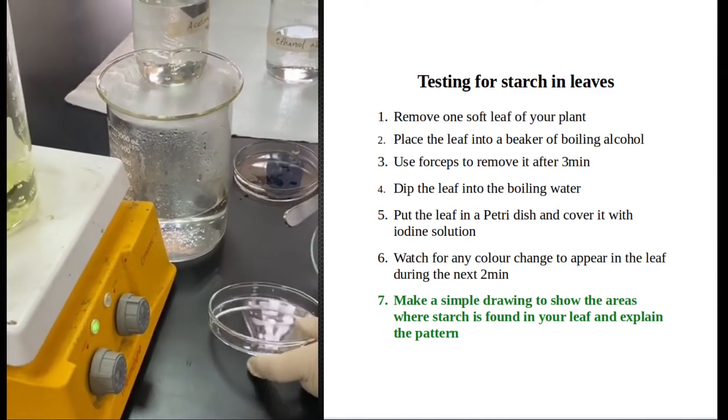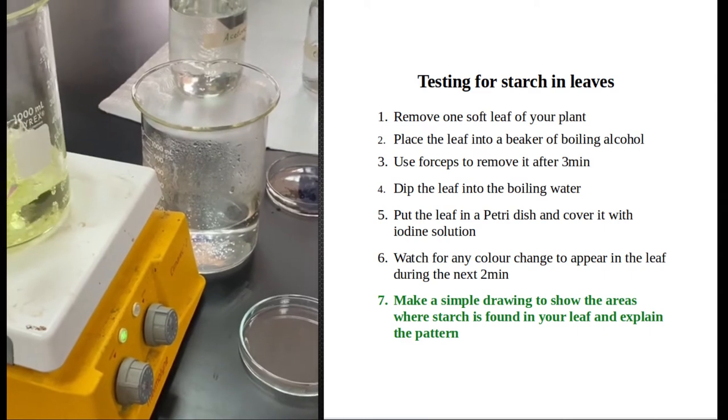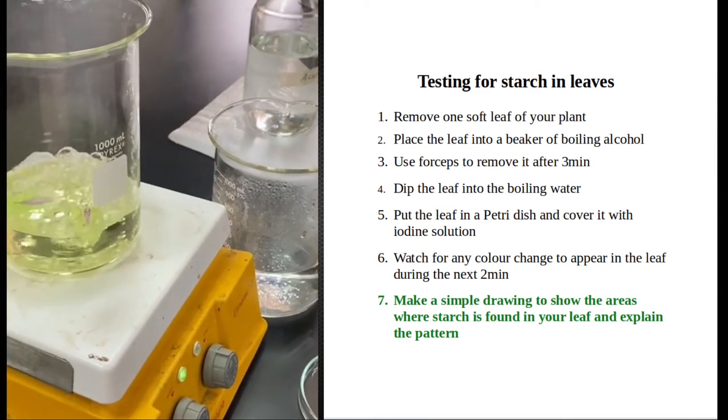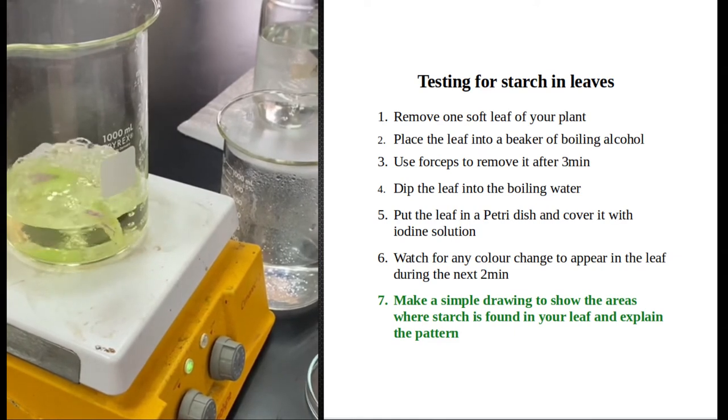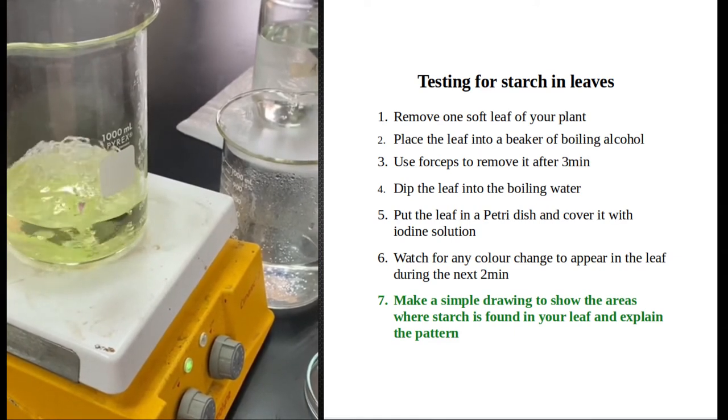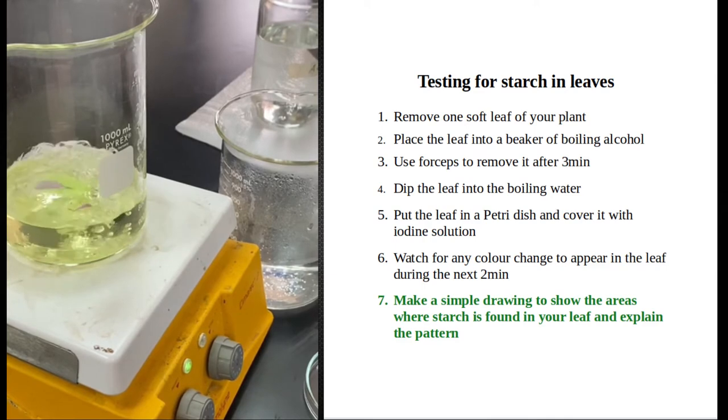It's going to take a minute for those leaves to lose all their pigments. You see the ethanol starts becoming green in color, which means that the leaf is losing its pigments. We will leave it for a minute before removing them.